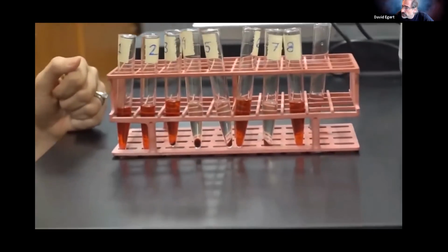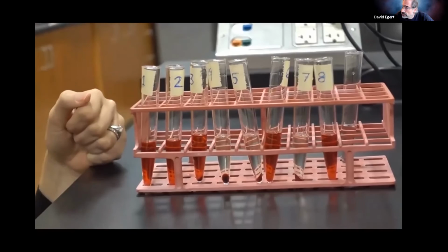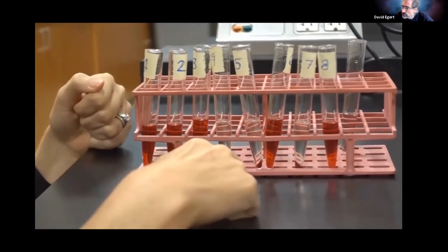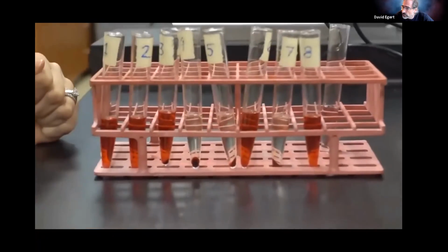If we do a visual look at these, you clearly see number 4 and 5 have clear supernatant. The fluid on top of the pellet is known as supernatant, and so those have clear. You also see it in test tube 7.